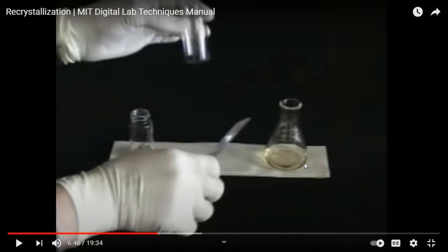If you are listening to me so far, this solution is the solution that you dissolved your mixture solid in, in 2 stages, right? When it's cold, it wasn't dissolving. When it's hot, it was able to be dissolved. Now you have a color and you need to add this charcoal to remove color, reduce the solution's temperature. Why? Okay? Type it. Type on the screen.